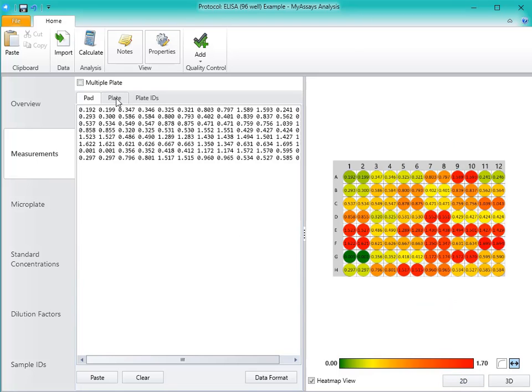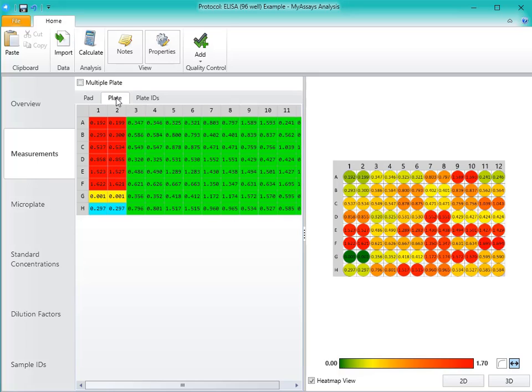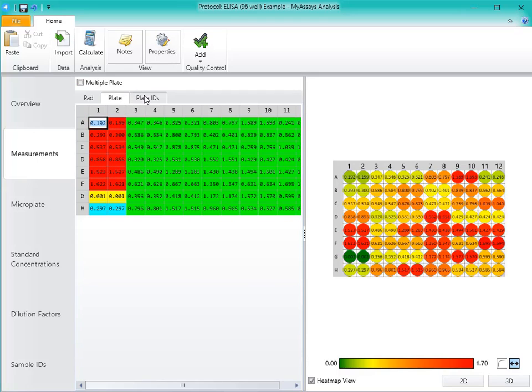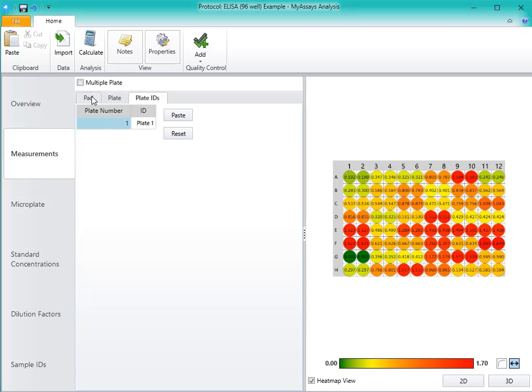The plate view will display the data in the plate layout format with editable cells. The plate IDs tab will show the plate IDs. On the Pad view, you can choose to copy and paste in your data, or you could choose to use the Import Wizard and follow the steps to import your data into the protocol.